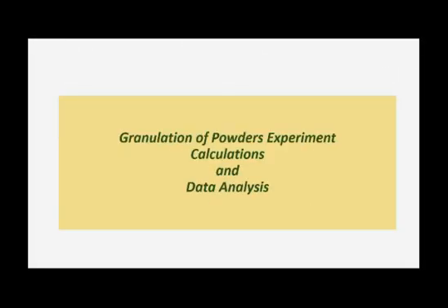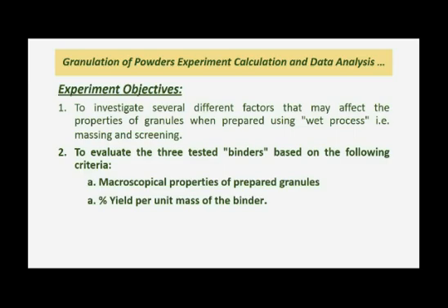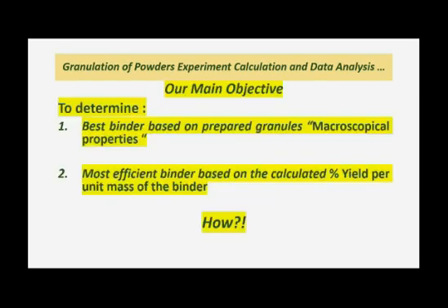This is a granulation of powders experiment, data analysis and calculations. Our experiment objectives were to investigate several different factors that may affect the properties of granules when prepared using wet process, massing and screening as an example.